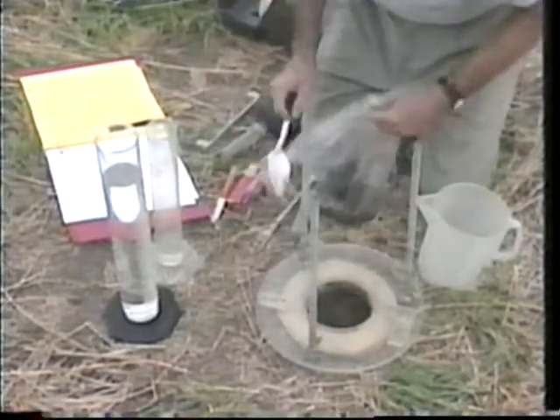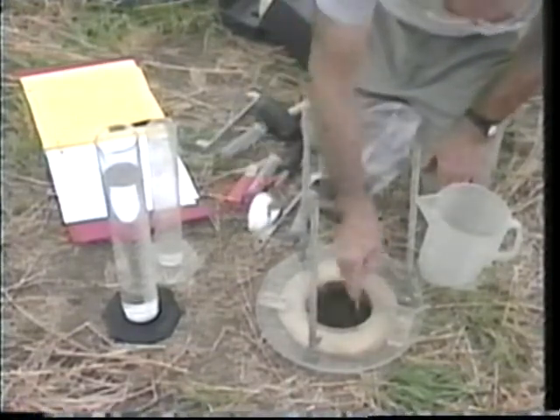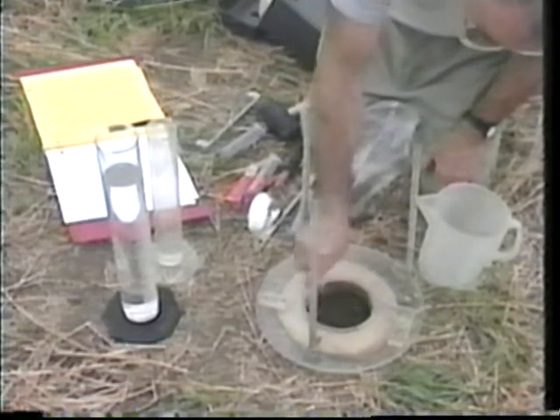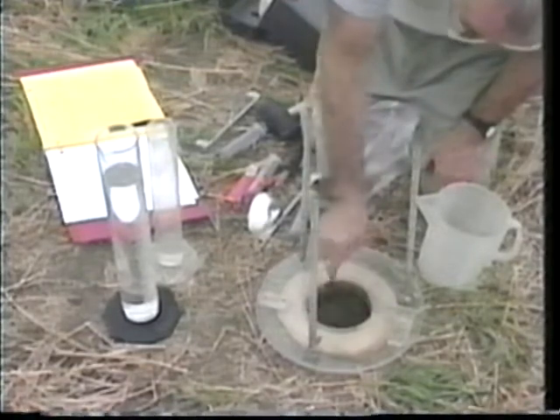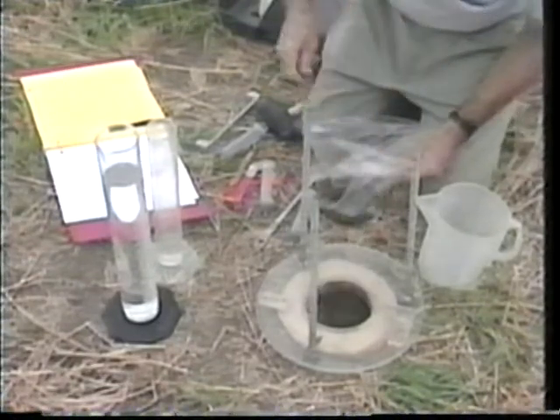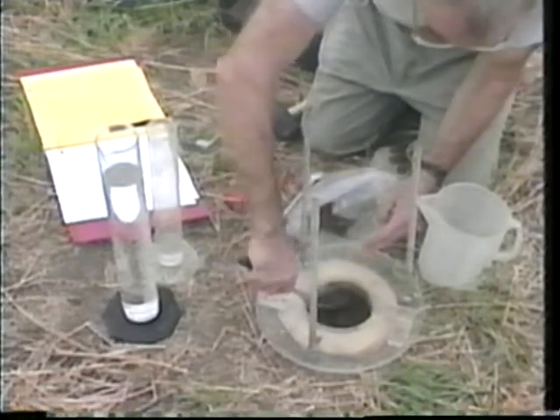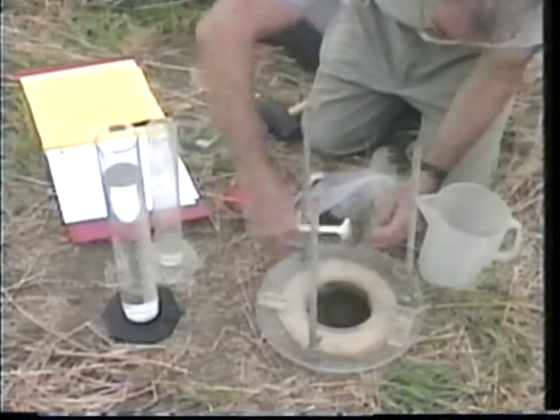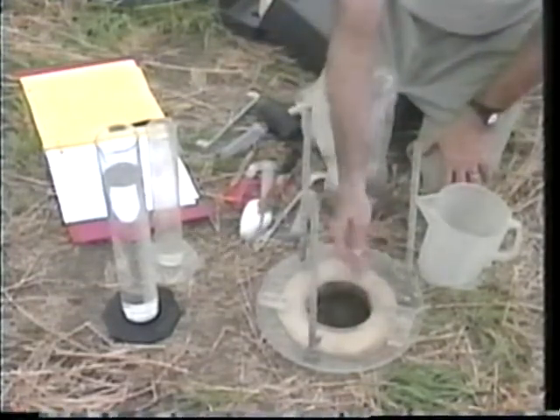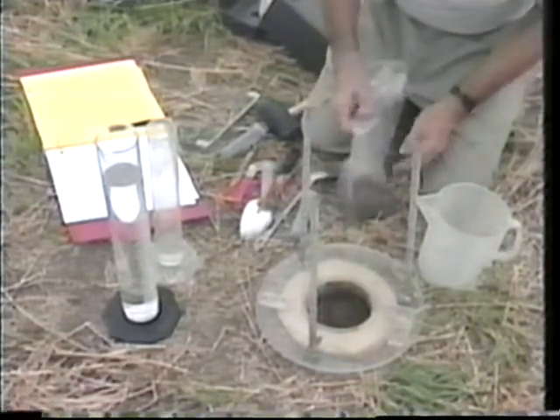The excavation should be a cylinder — not a soup bowl. It should be a cylinder that is coincident with the edge of the hole in the rigid plate, because we want the cross-sectional area of the hole to be constant. Don't make soup plates — make cylinders and keep the excavation about the diameter of the hole in the rigid plate.